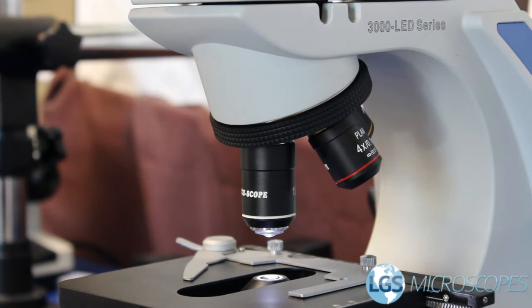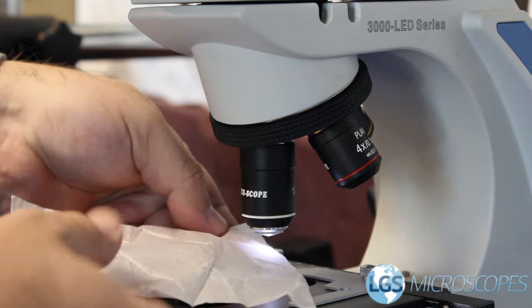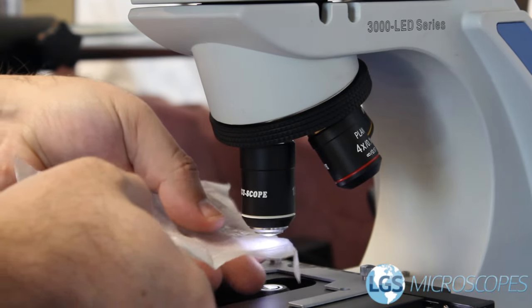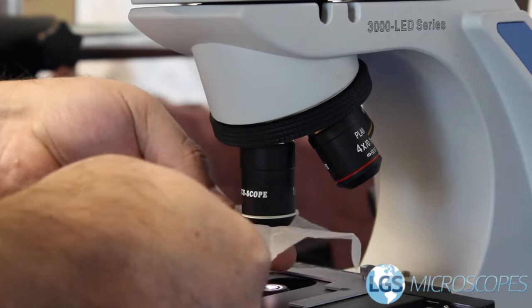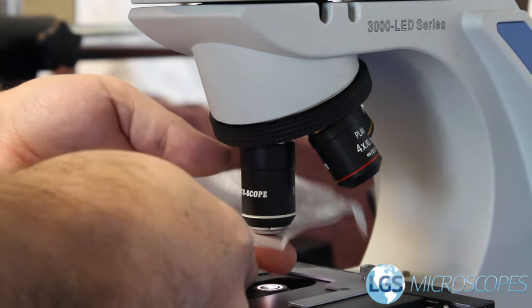Then you use this lens paper to dab off the oil from the 100x objective bit by bit, just going around the piece of paper, not wiping but dabbing, and keep going until there's no more oil coming off of the objective.